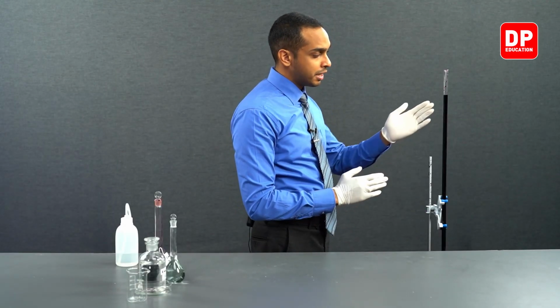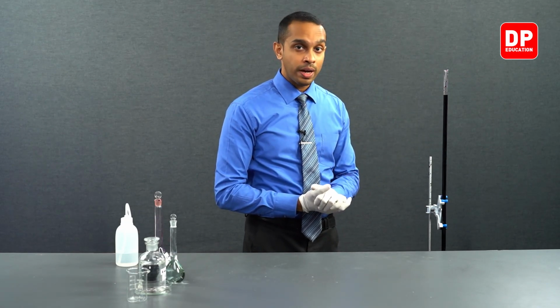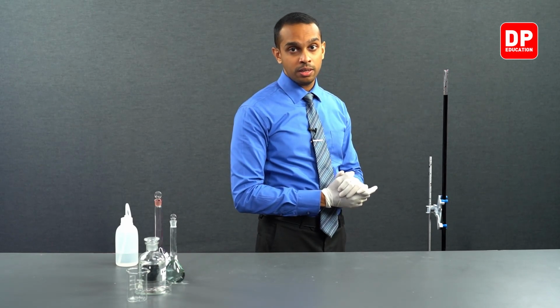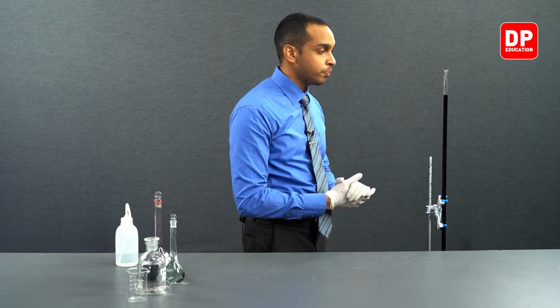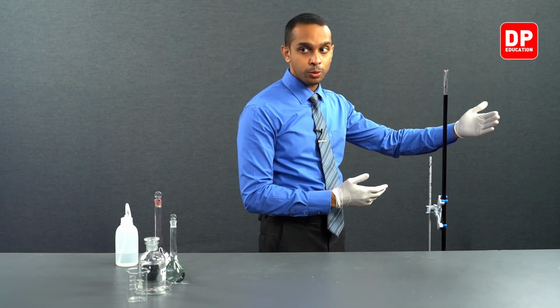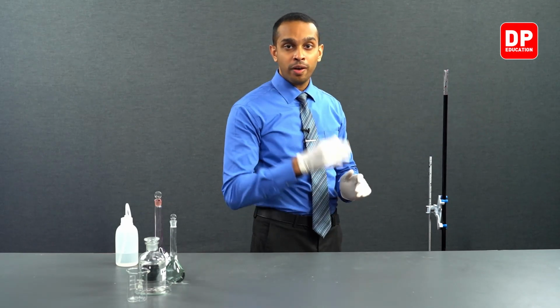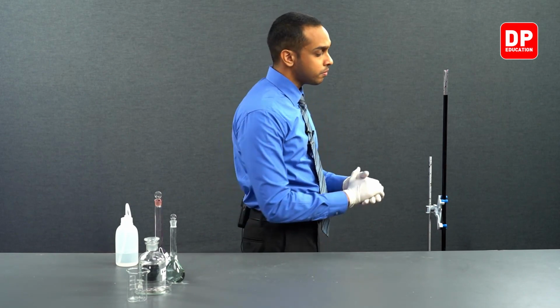Especially when it comes to a dark colored solution like this, finding the zero line could be difficult if you are doing it in a dark environment. So please make sure that you have some sort of light source behind the burette so that you can find where the zero line is easily.